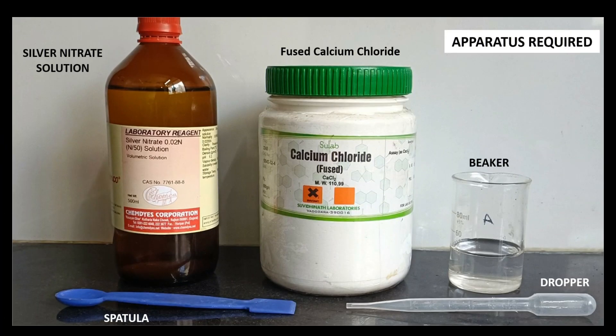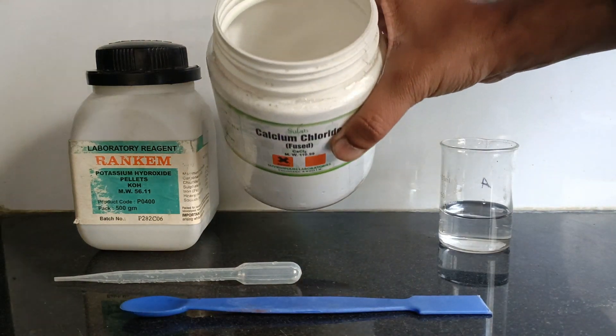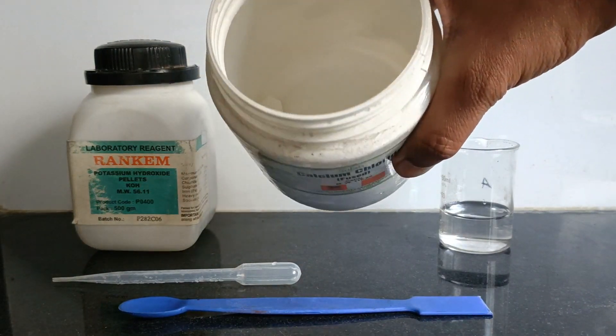Jai Hind Vande Mataram, this is Kunal Mehta from Make Me Scientific. In this video I am going to demonstrate a precipitation reaction between calcium chloride and potassium hydroxide. Here we have calcium chloride, a white crystalline solid.